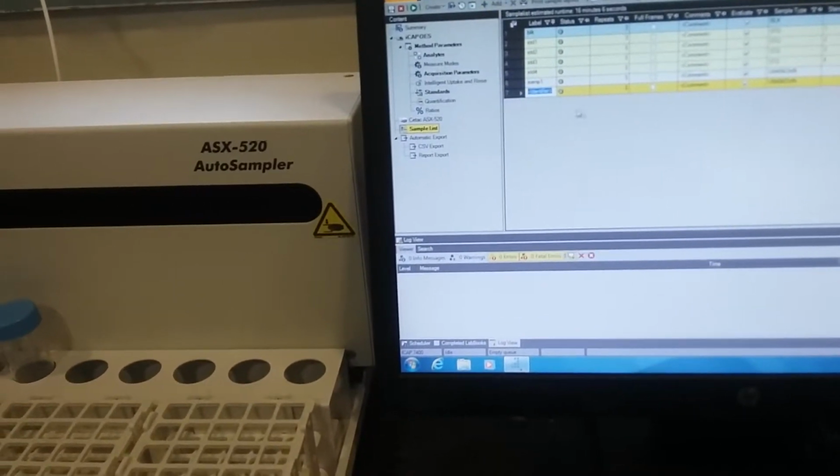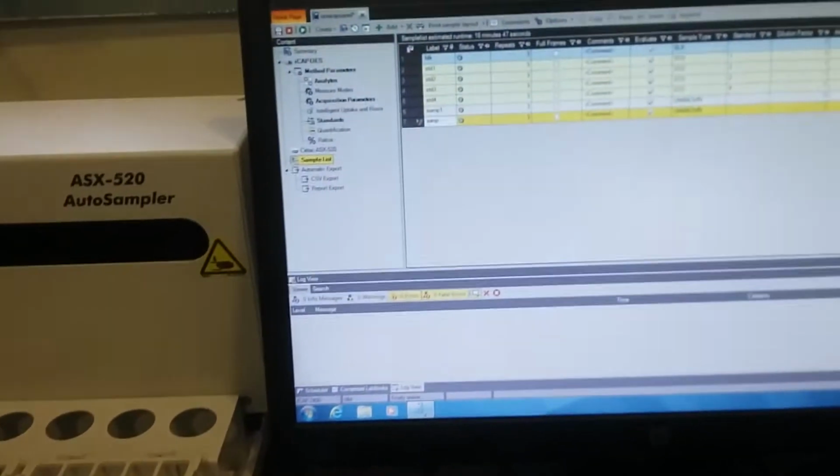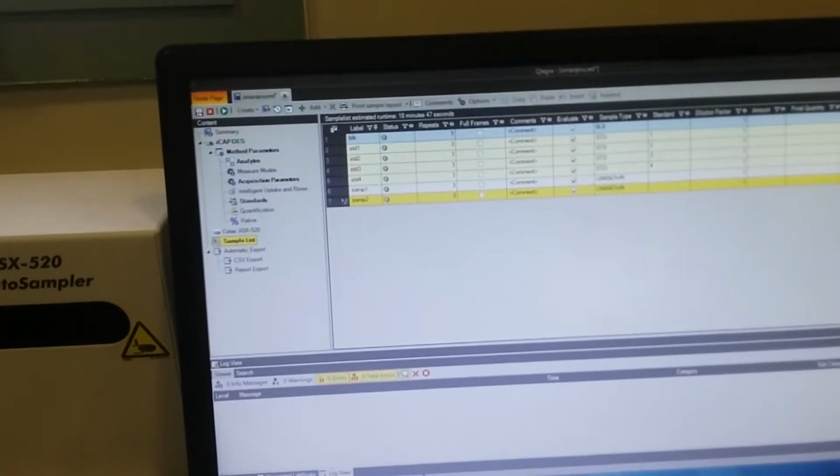And then we add some, and then unknown, and then go to one, and then number two. That's it, right? Good. Now you can position it. Later you will save it. Save. After that, save here. As is. Comment. Okay.